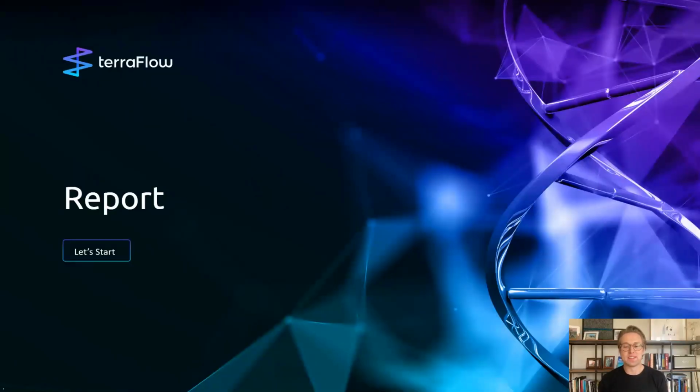We have a forthcoming Cell Immunology paper that goes into that algorithm in more detail, but I think our analysis is ready. So I'm just going to go ahead and show you what the actual report looks like from a user's point of view. So remember, we uploaded our data, and in 24 hours, we're going to get an email that says, "Hello, thank you for uploading. Click here to see your results."